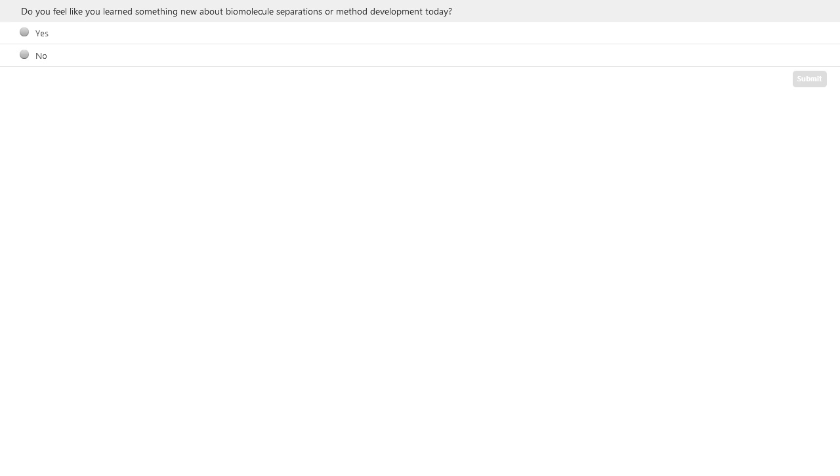I know there's been a lot of work more recently with DFA, so difluoroacetic acid. So that could be another alternative. There's a lot being published in the literature currently about DFA. So if you can't get to really low concentrations of TFA, then I'd consider DFA as an alternative. Sometimes formic acid will be okay. We just haven't had a lot of success actually with the proteins we've been working with formic.